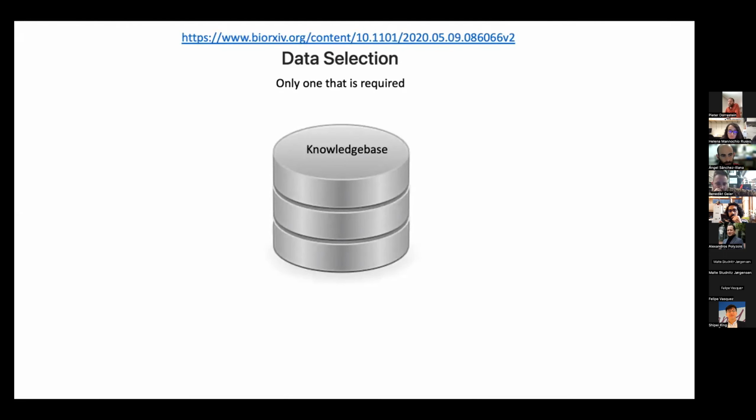This is also the one that we feel is required, because we actually want to connect the microbial metabolites to raw information or raw data so that we can reuse that data. It's very similar in the sequencing world, where if you want to identify an organism, you link it to the sequencing, so that you can reuse that sequence information to find that same metabolite or same sequence in other data sets.